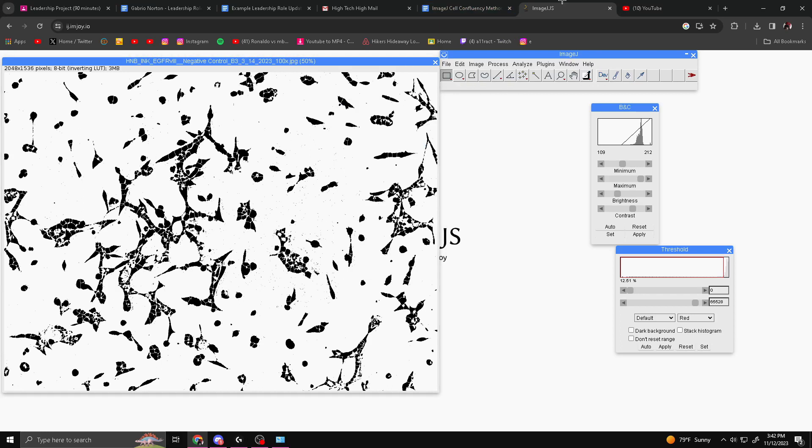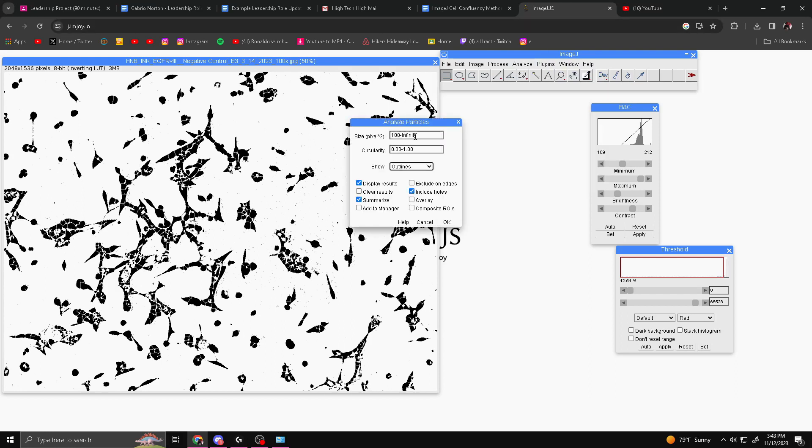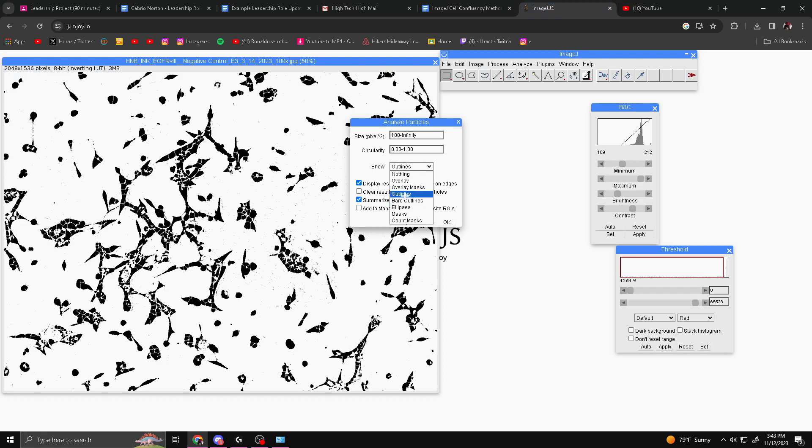Next, you're going to carry out the cell count. You can do this by going to Analyze, Analyze Particles. Once you have this open, you want to make sure you type in 100 to infinity. Once you type that in, you want to make sure that Show is set to Outlines and that these boxes are checked: Display Results, Summarize, and Include Holes. Then you want to hit OK.